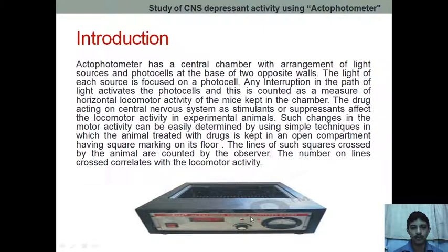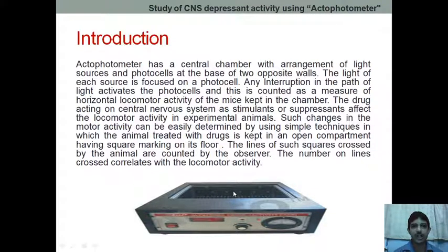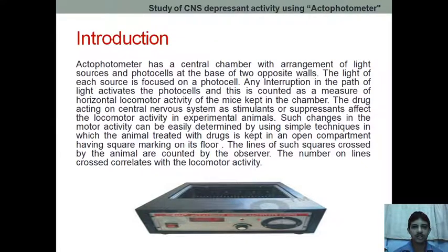In the actophotometer, this is the central chamber, and the light sources are here. The photocells are present on the opposite side, so each light source is focused on the photocells. Any interruption in the path of light activates the photocell, and this is counted as a measure of horizontal locomotor activity.